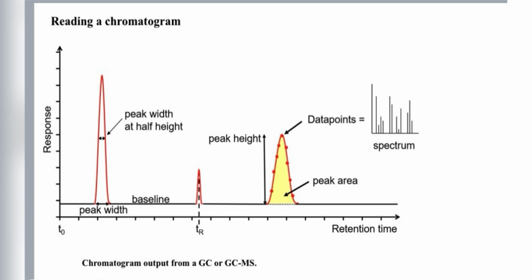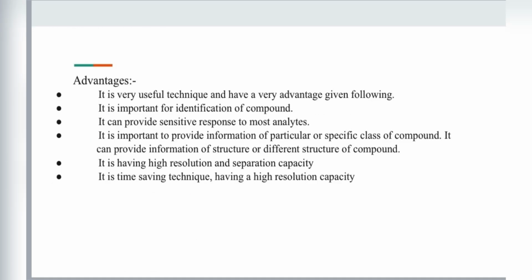The advantages are as follows: it allows important identification of compounds, and responds to most analytes. It is also specific to classes of compounds, having good resolution and separation capacity. It is a time-saving technique having high resolution capacity.